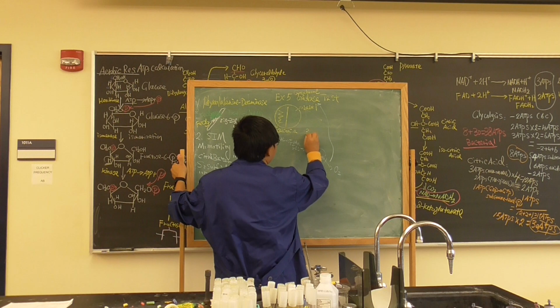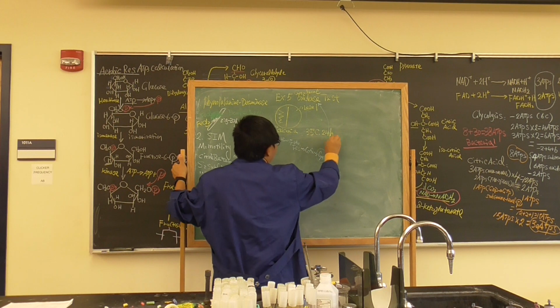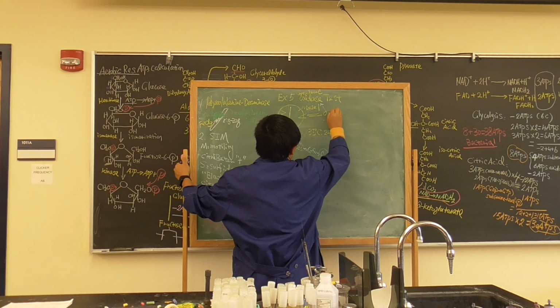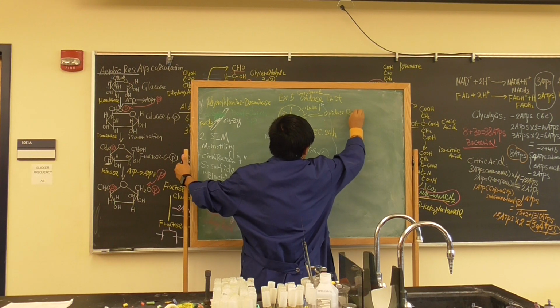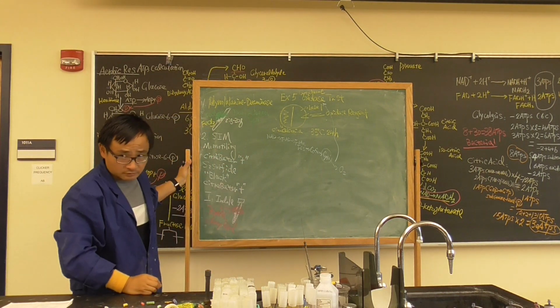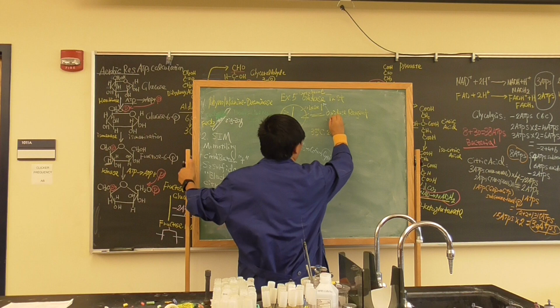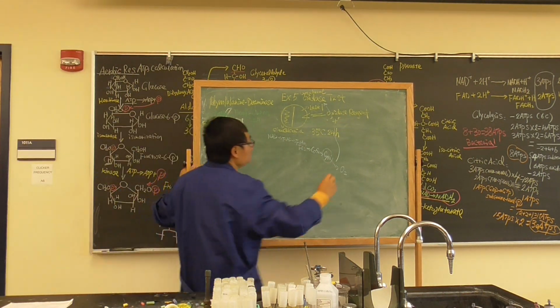Okay, now we prepare this plate today. Then we have to incubate at 35 degrees Celsius for 24 hours. And then we're going to pour the oxidase reagent. You don't have to know the name. It's very, very long. I don't even remember it. When you pour it, if it's positive, it will show you a purple color.